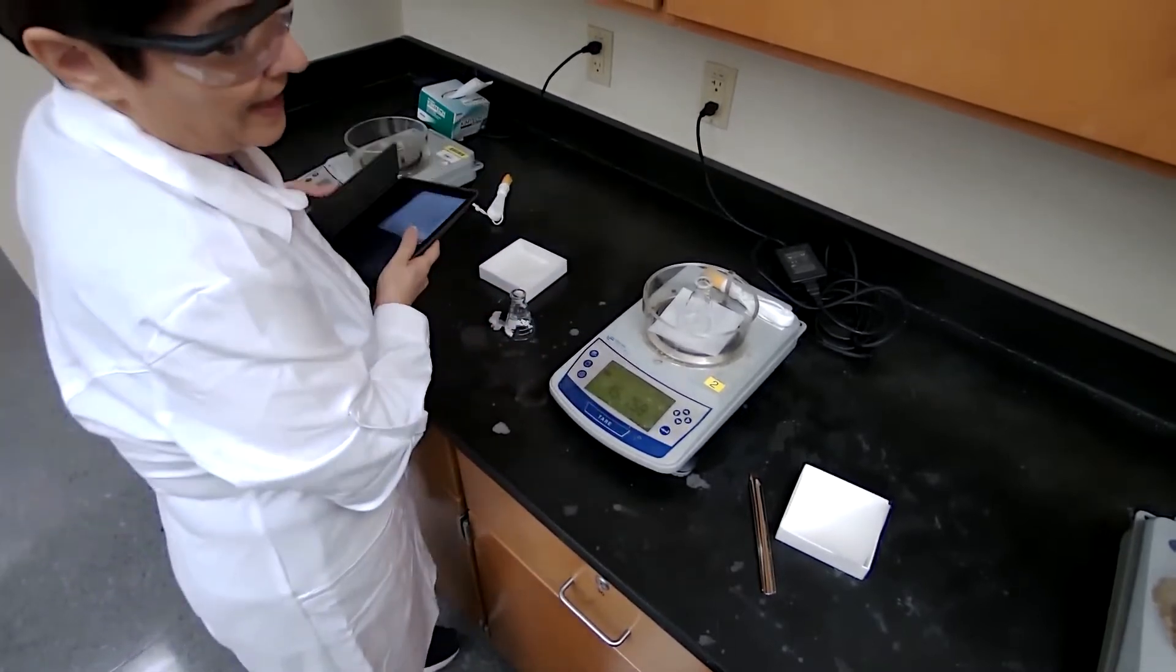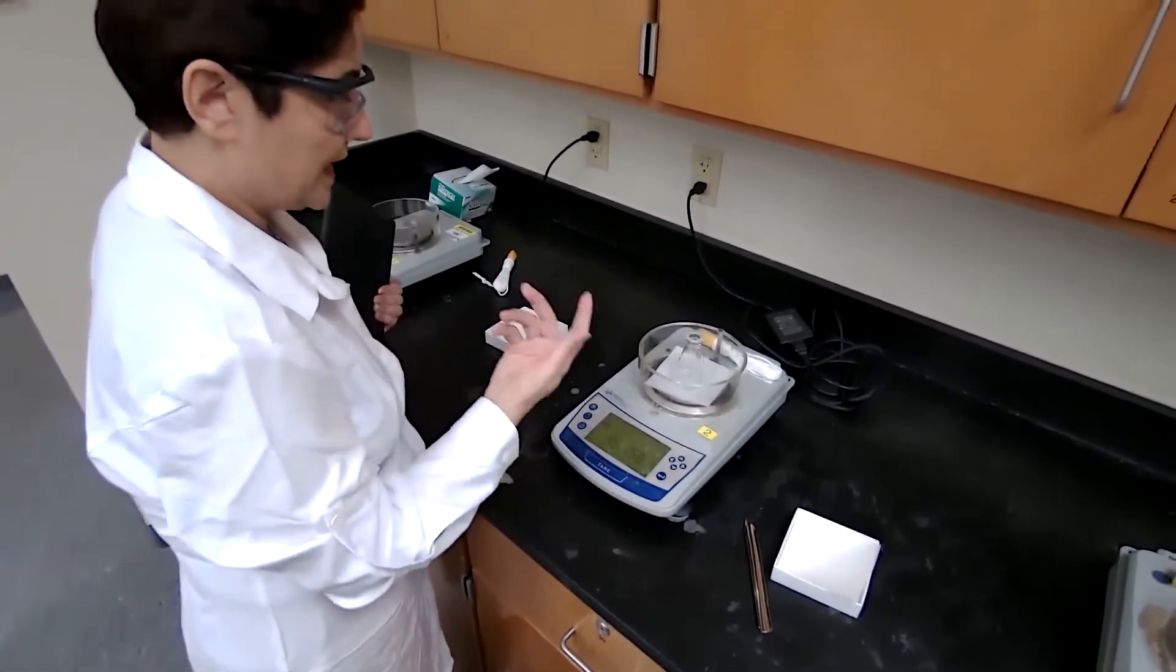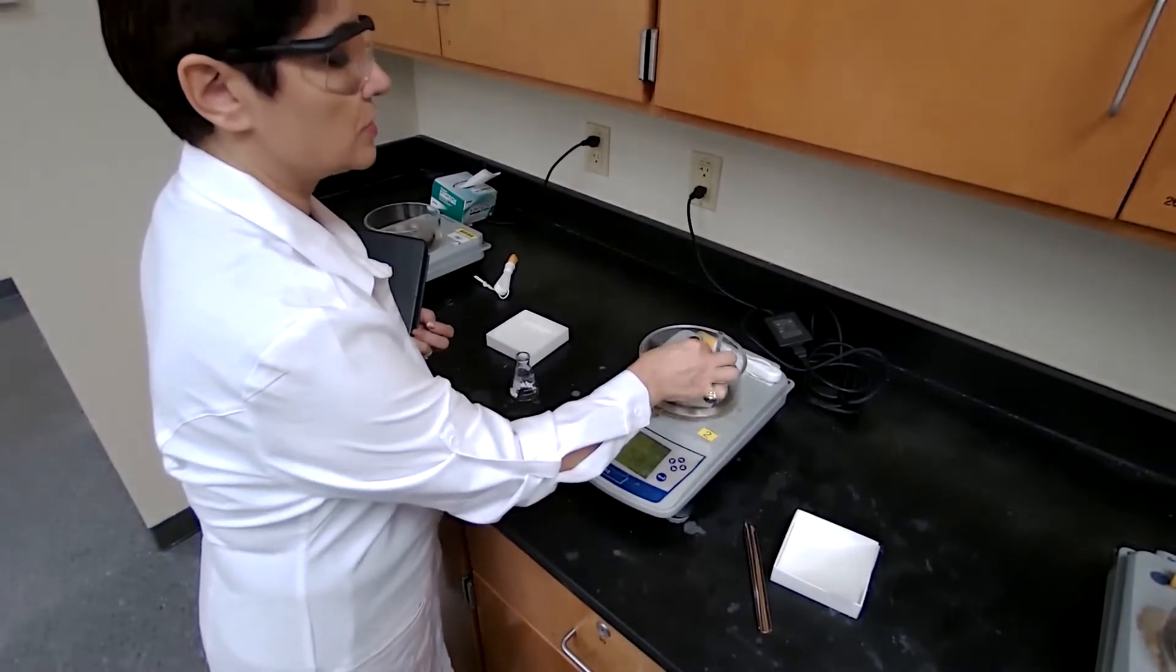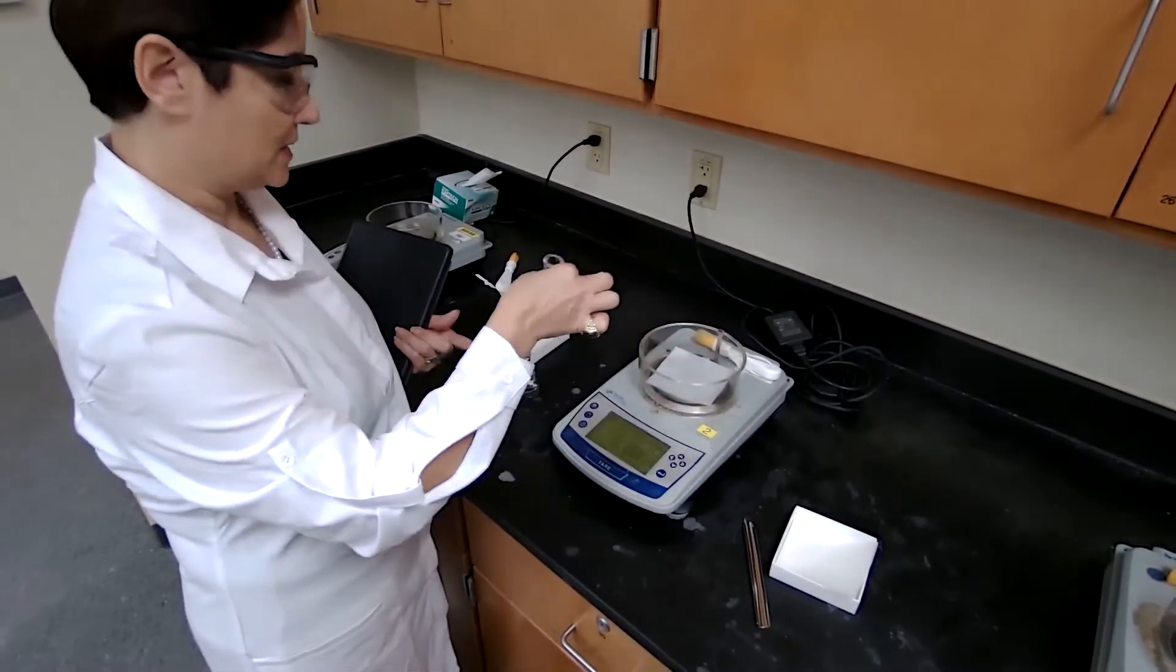Now we have the mass of the product for our calculation for percent yield. We do the chemical test at this point.